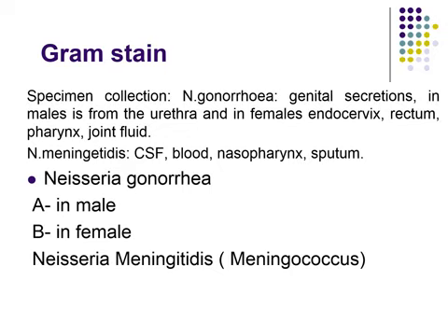So a gram stain in a female is only a presumptive diagnosis. And if you suspect that, you must move to another step to confirm this result, which is the culture technique.